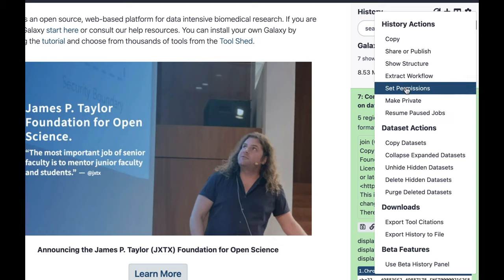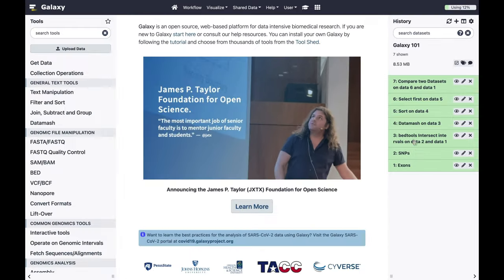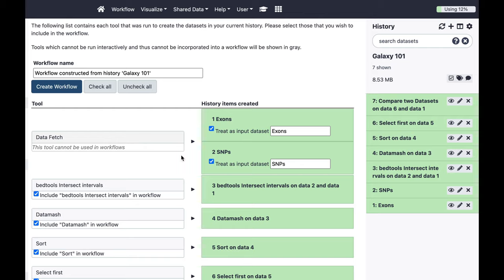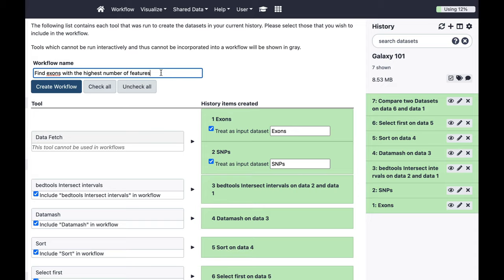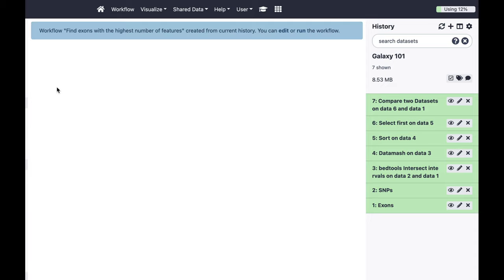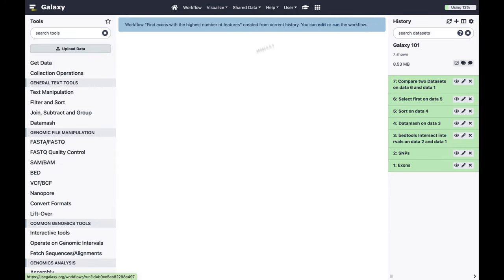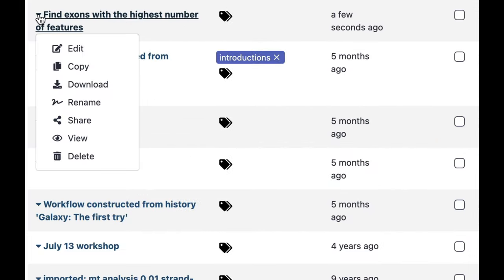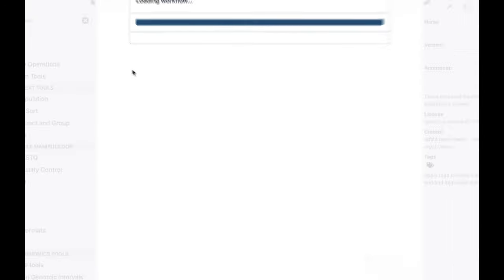Let's collapse all datasets to get a neat view of the history. This history is essentially an outline of our analysis. Suppose you want to perform the same analysis on a different dataset — instead of redoing it step by step, you can extract a workflow from this history. This interface asks which steps to include; we want all of them. Let's call this workflow 'Find Exons with the Highest Number of Features' and click 'Create Workflow'. You can then edit or run it from the Workflow tab.